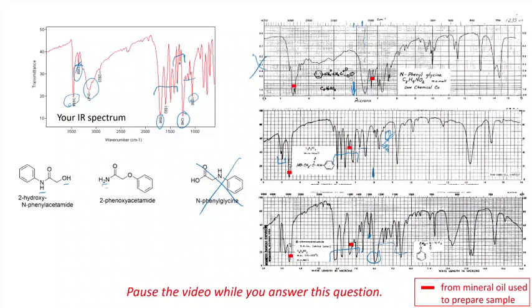We continue on. Now this part on the right, this whole region, 1000 to 600, is this little region right here on our spectrum. Okay, so that's been very much stretched out in this other machine. But what we can see is that in that region, in the top one, we have two major absorptions.